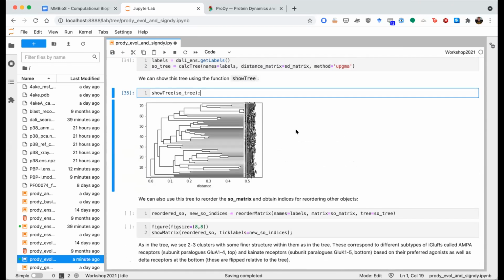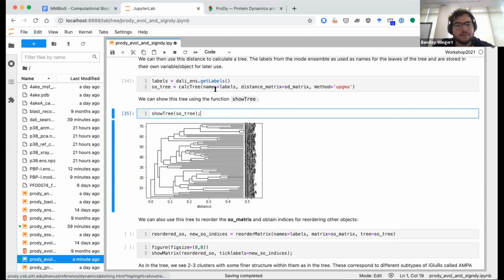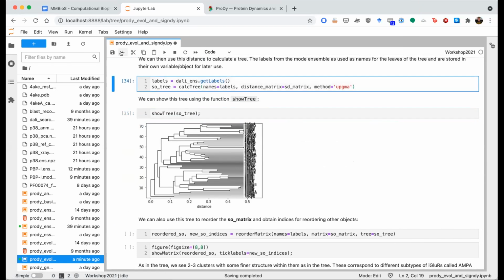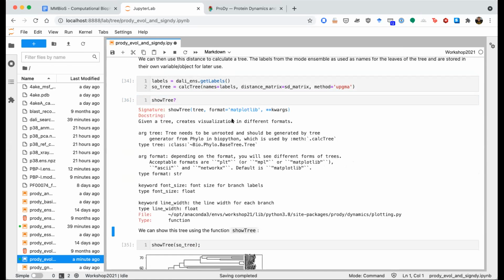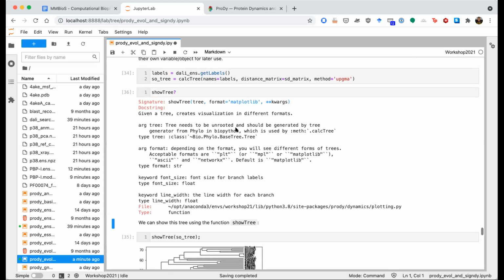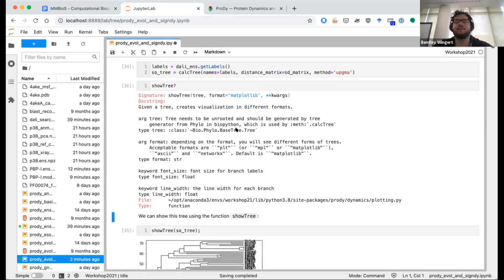Kind of related to that, can I ask a quick question? Yeah. Is there a way to save these charts and graphs as a .ai file, so that they can be cleaned up or polished up, or is it just .png files that you can save as? Is that an Illustrator file? Yeah, Illustrator, Photoshop, any sort of vector. I would prefer a vector file.